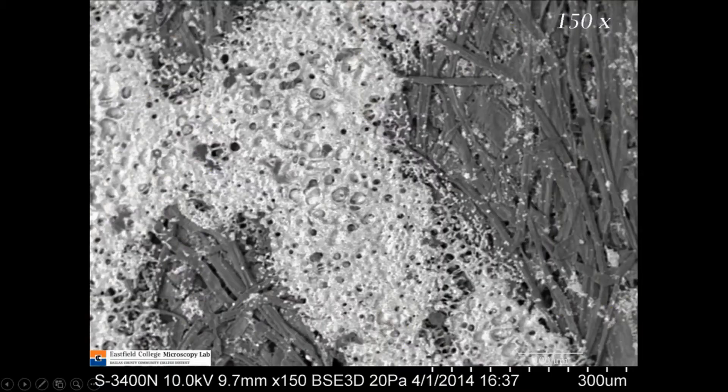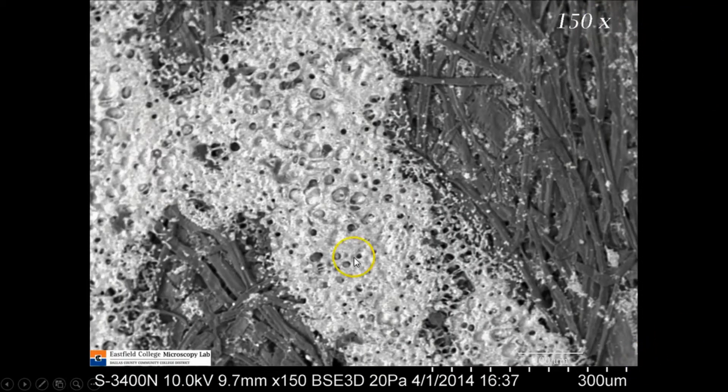Now let's go to the electron microscope. This is almost the same magnification — the previous one was 160X, and the electron microscope is 150X. Here you see just the opposite — it's the inverse. The ink now appears brighter than the paper. That's because we're no longer using light to make this image; we're using a beam of electrons. The electron microscope measures how many electrons come back off of the substance. The ink in laser printers contains a lot of iron, so it reflects electrons really well, while the paper doesn't — it absorbs a lot of them.